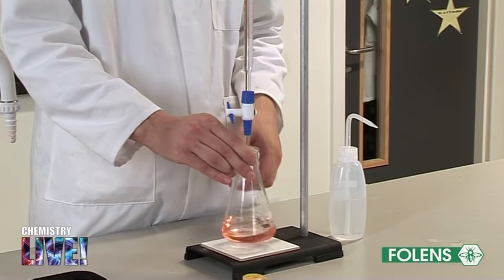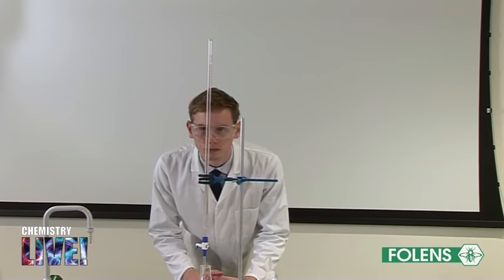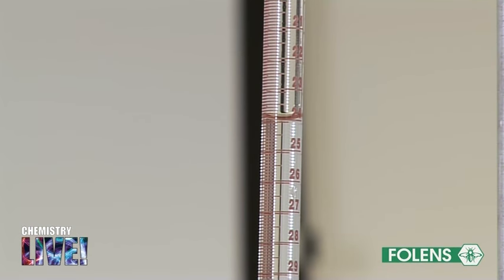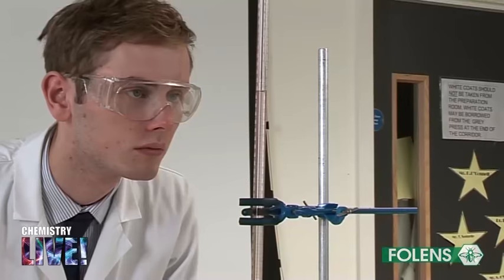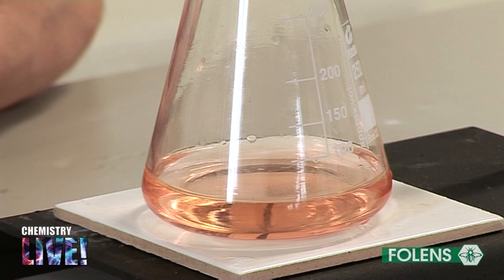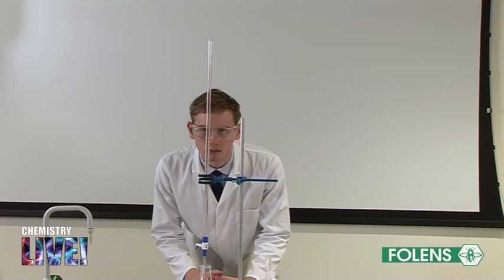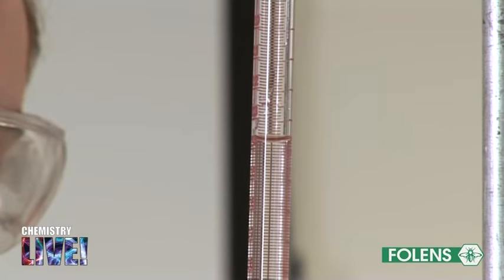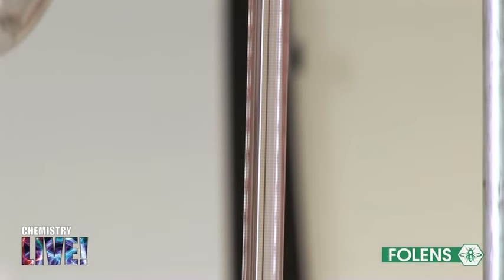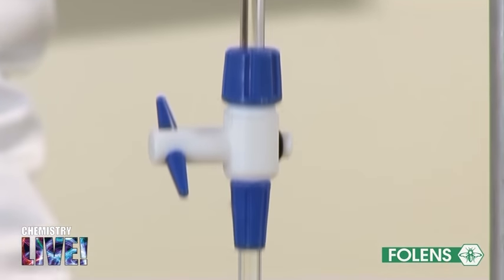The results of these two accurate titrations should agree to within 0.1 centimeters cubed. If they do not agree, a further titration should be carried out until agreement to within 0.1 centimeters cubed is obtained. The titration result, also called the titer for this experiment, is taken as the average of the two readings which agree to within 0.1 centimeters cubed. The rough titration performed to give you an approximate idea where the end point is should be neglected.